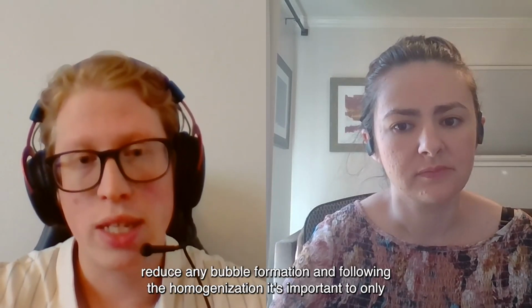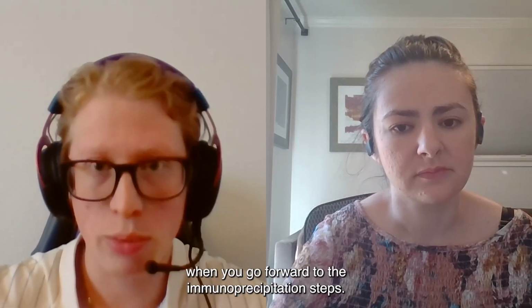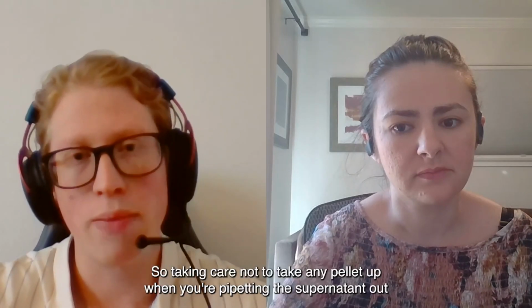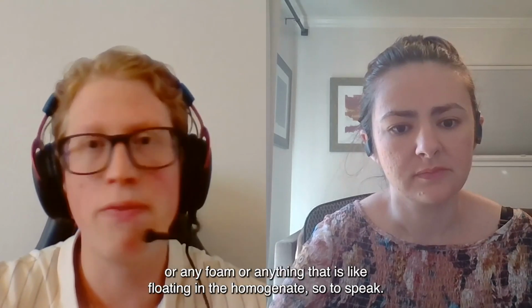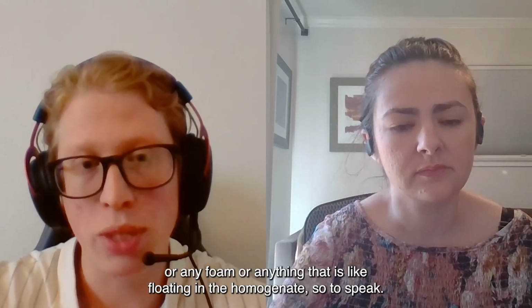And following the homogenization, it's important to only use fully solubilized homogenate when you go forward to the immunoprecipitation steps. So taking care not to take any pellet up when you're pipetting the supernatant out, or any foam or anything that is like floating in the homogenate, so to speak.